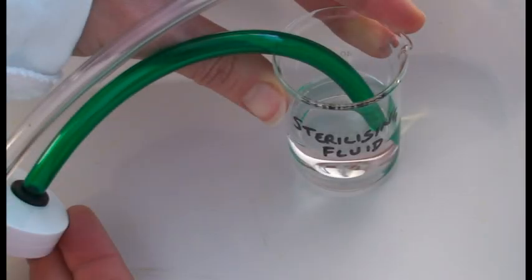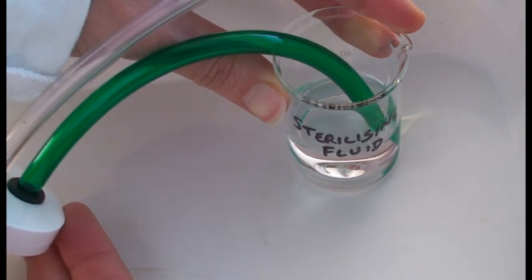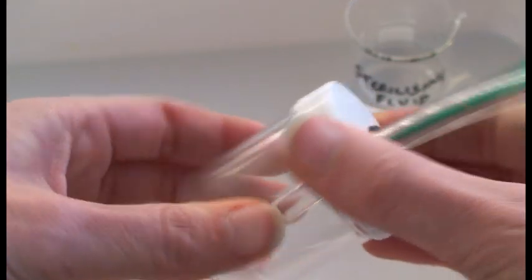Using a pooter involves putting the end of the shorter or stoppered tube into your mouth, so it is important to make sure it has been sterilised. Once the pooter has been sterilised and constructed, then collection of mini-beasts can begin.